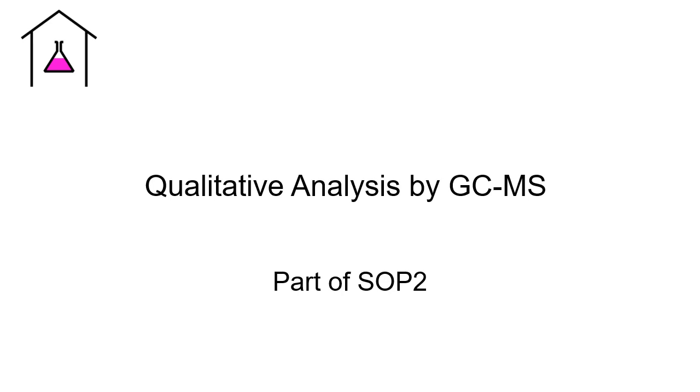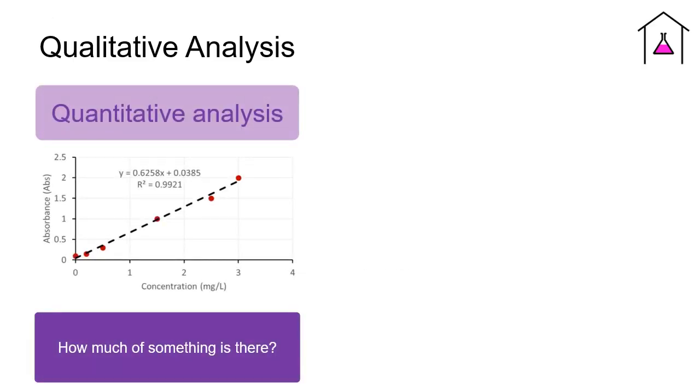In this video, I'm going to show you how to complete the qualitative analysis part of SOP2. In the first year labs, we focused entirely on quantitative analysis. So that's analysing a sample in order to determine exactly how much of a component of that sample is present.